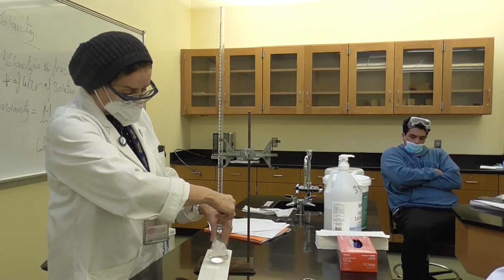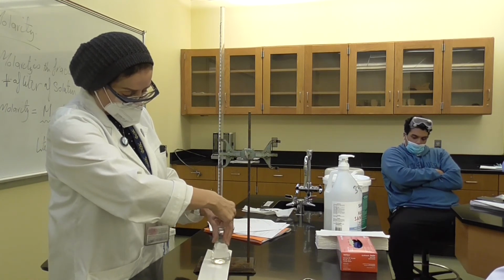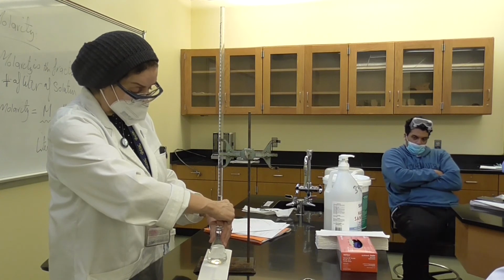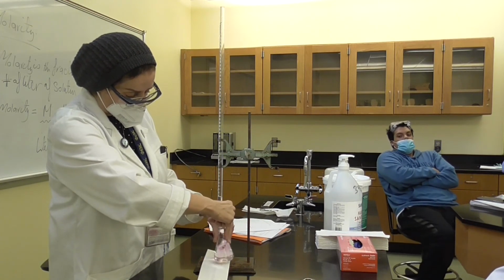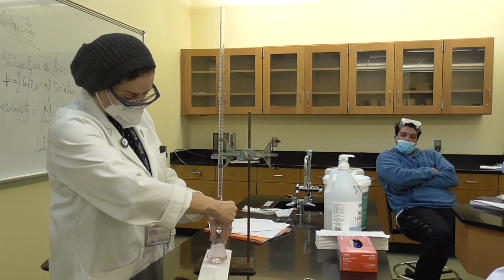It's staying longer. I'm still swirling. So you see here is how long it takes. It actually stayed longer. So I'm going to be very careful, and maybe one drop will keep it, and sometimes it disappears.